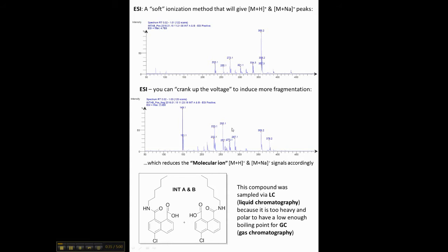If we're dealing instead with GCMS, then it will be the mass of the compound itself, where you have simply knocked an electron out of the system and left it charged. In any event, the peaks on the far right are the ones that correspond to the greatest mass of the compound, which is to say the molecular structure itself. Then, because the molecule is at relatively high energy and unstable, it will have a tendency to fall apart into various smaller fragments.